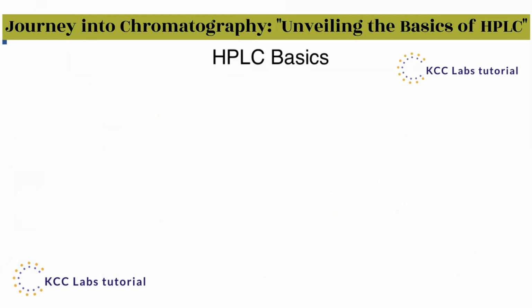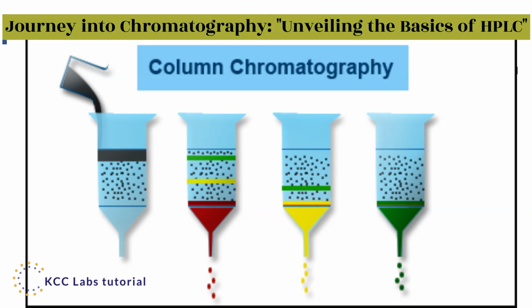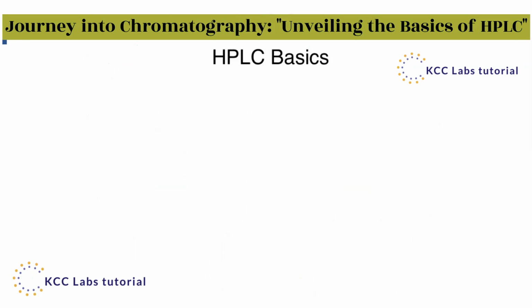The first thing that we want to have an understanding of is what chromatography is. When we use the term chromatography, we're talking about a separation of compounds. Traditionally, when chromatography was first discovered, it was basically just a separation on silica or alumina type gel, and you could literally see the colors separating out from these different organic compounds, and that's where the name chromatography comes from. The chroma part, with the color, is referring to that separation where you could visually see colors.